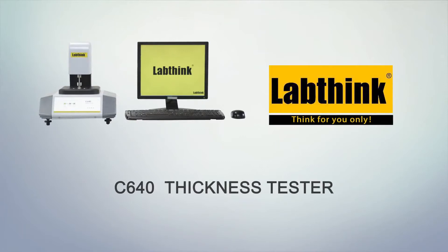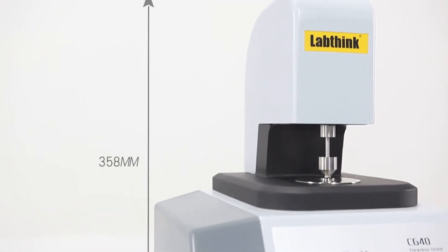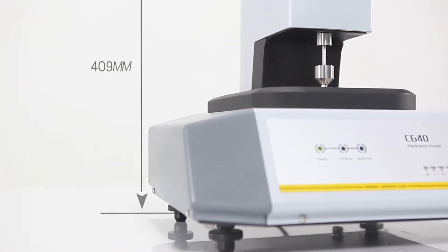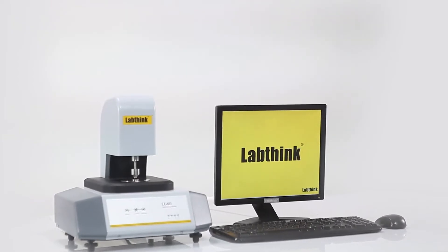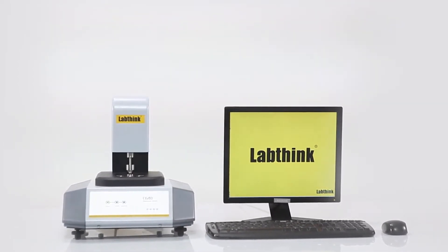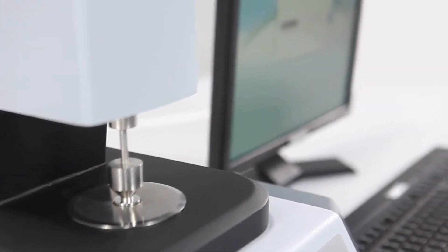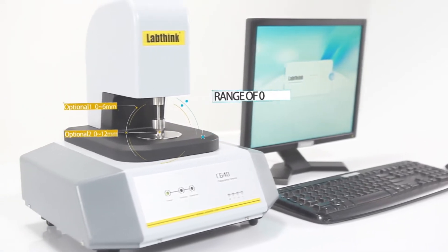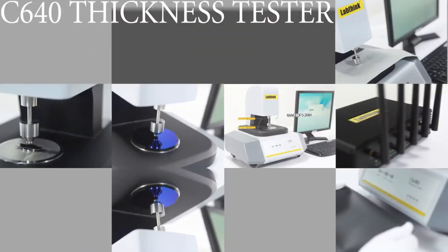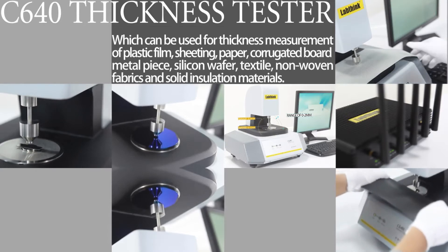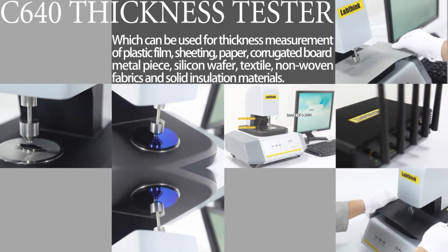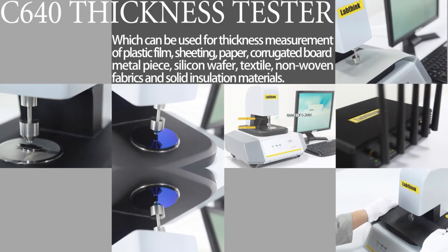C640 Thickness Tester. C640 is a high-precision mechanical contact method thickness tester within its test range of 0 to 2 millimeters which can be used for thickness measurement of plastic film, sheeting, paper, corrugated board, metal piece, silicon wafer, textile, non-woven fabrics, and solid insulation materials.